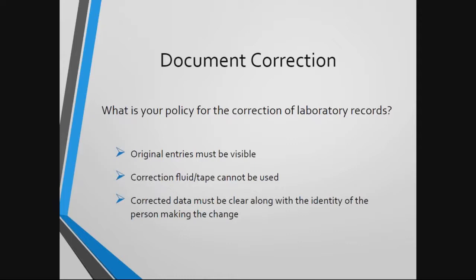One of the most frequent issues that I encounter during inspections is document correction. Lab staff are always so very particular about making sure that our documentation is neat and tidy. So when an error is made on a lab document, we like to white it out or use the whiteout tape, so that we can then place the new entry on top and it looks clean and neat. Unfortunately, this is not acceptable.